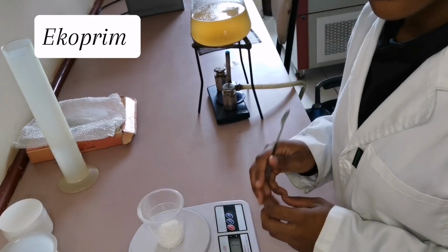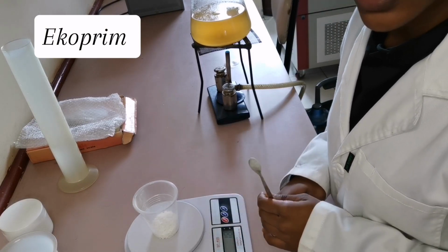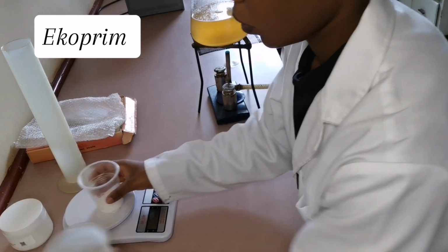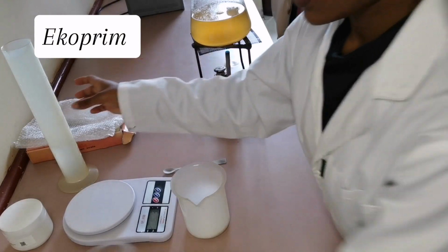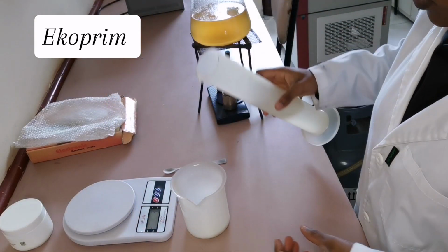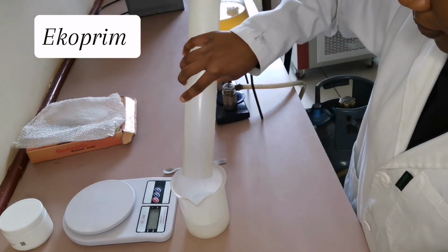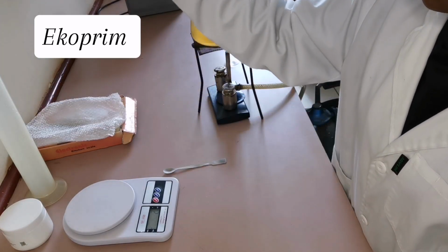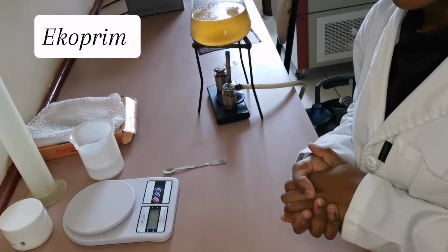Now we have to dissolve this Ekoprim powder using 200 ml of distilled water. Pour it in here, and this is the 200 ml of distilled water, like so. And that's it. So we leave it to dissolve. We just cover it so that it doesn't get contaminated.